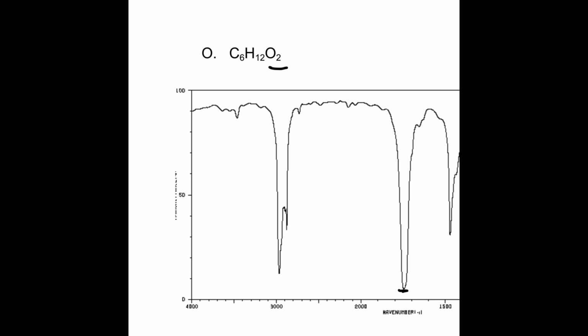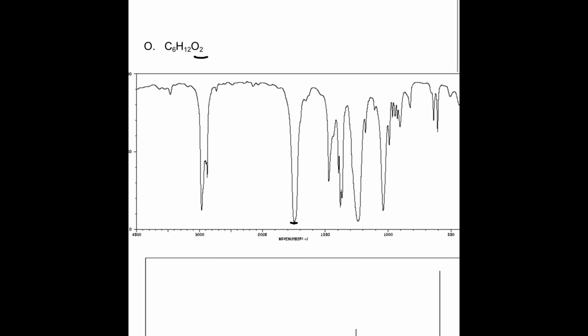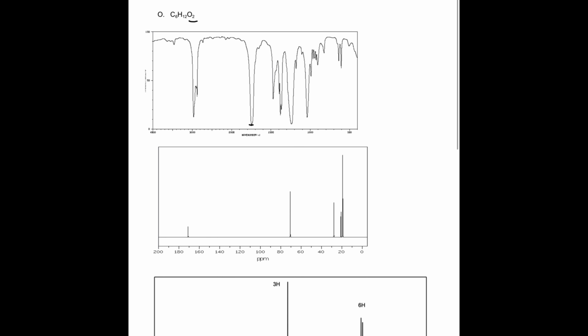So, in order to determine which functional group we have, we are going to look at the spectrum here. And we see at this absorption peak here, it is a 1745. So this absorption peak at 1745 is going to basically tell us which functional group we have. And according to the table of absorption peaks, the closest number to that is going to be an ester group. So yeah, we are going to have an ester group present.